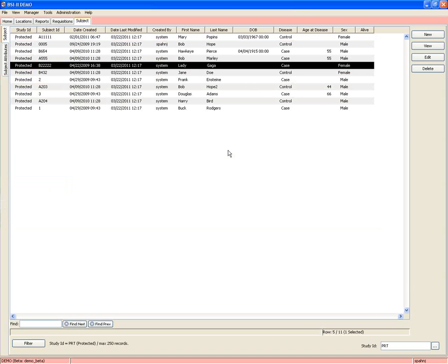It says, for scan file into locations, how are duplicate current labels handled? You'll get an error, I believe, saying that it has multiple matches and that you can't use the current label to scan and move stuff into locations. It has to be a unique current label.